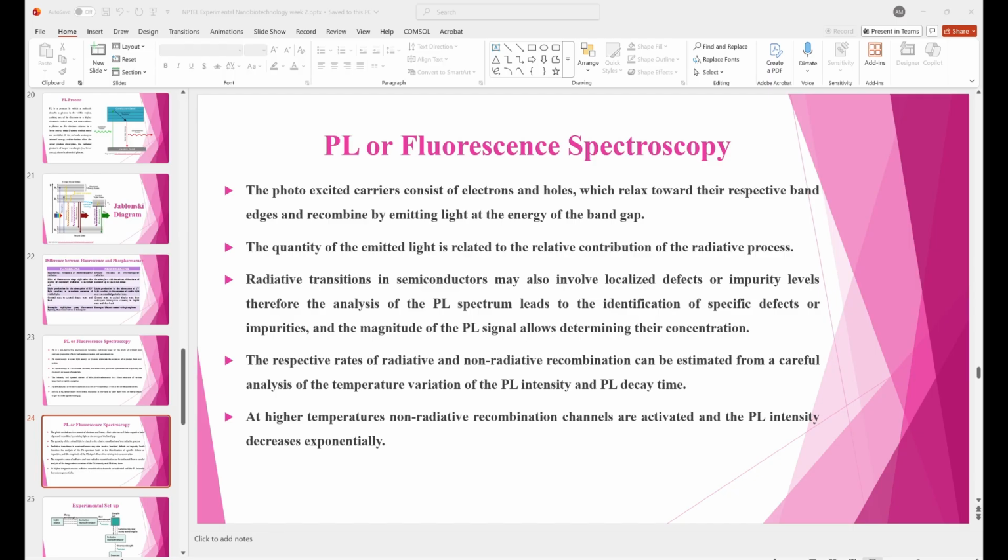So always don't use any nanoparticle suspended in any organic solvents, or clean your cuvettes in organic solvents while performing DLS or zeta potential.